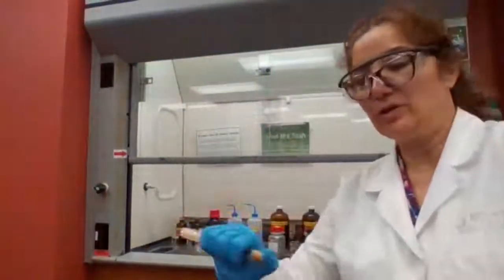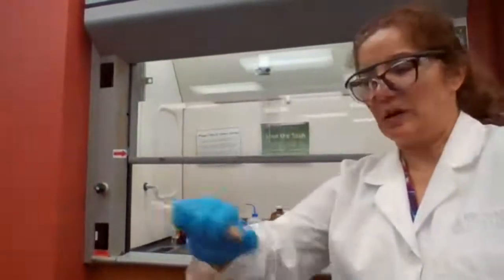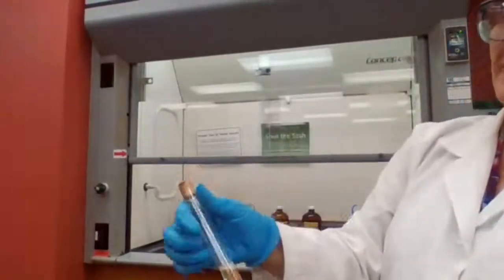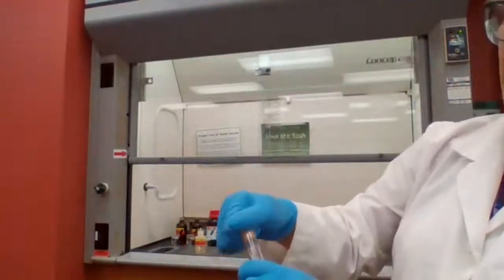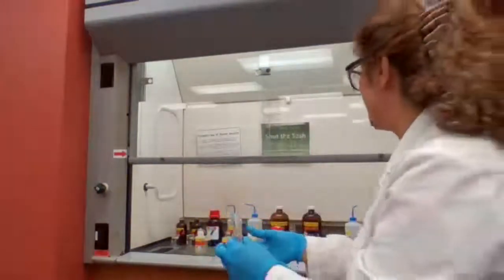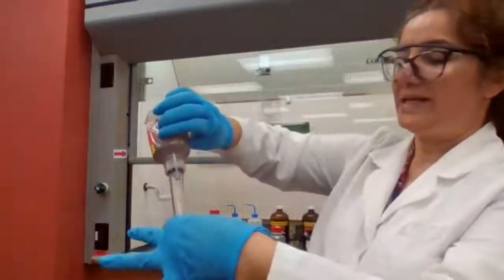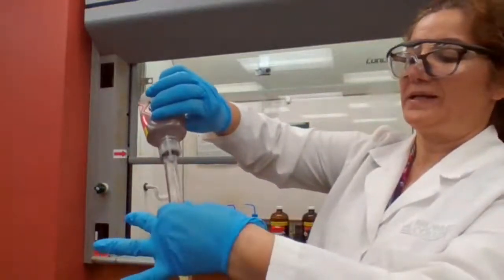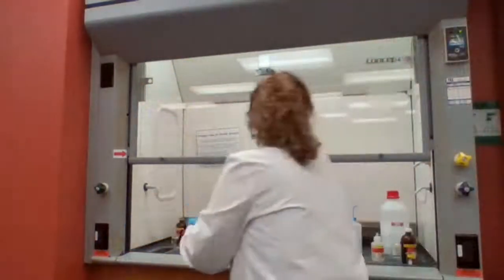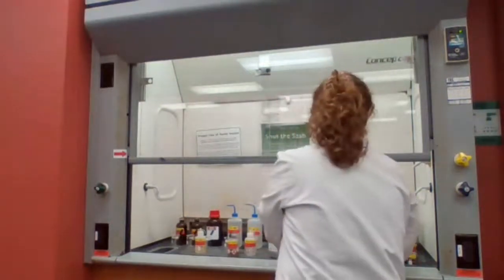Then, as I told you earlier, for silver nitrate, I haven't had the best result, but if it's positive, definitely it's carboxylic acid. If it's negative, we cannot say it's not carboxylic acid. So we have to make sure that we have the solubility test as a backup. Adding more silver nitrate, hoping that I get more precipitate. So this way you can actually see the cloudy particles.